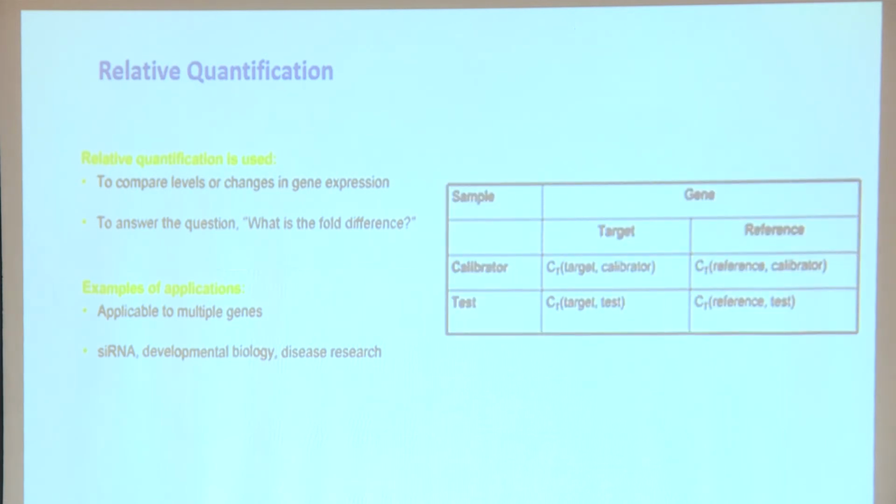In relative quantitation, which most of you are quite familiar with, always remember, you have to use two different control points. One is called the calibrator, another one is called the reference. Let us take a small example that will give you better clarity on this. Calibrator is nothing but a plant which is not treated at all.